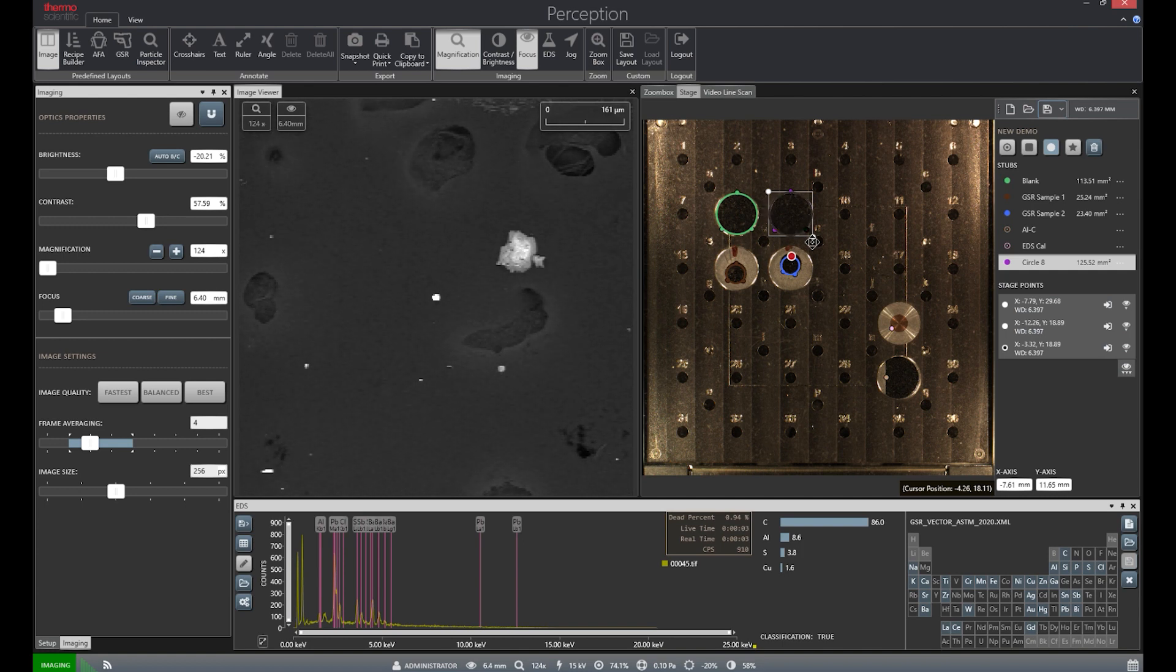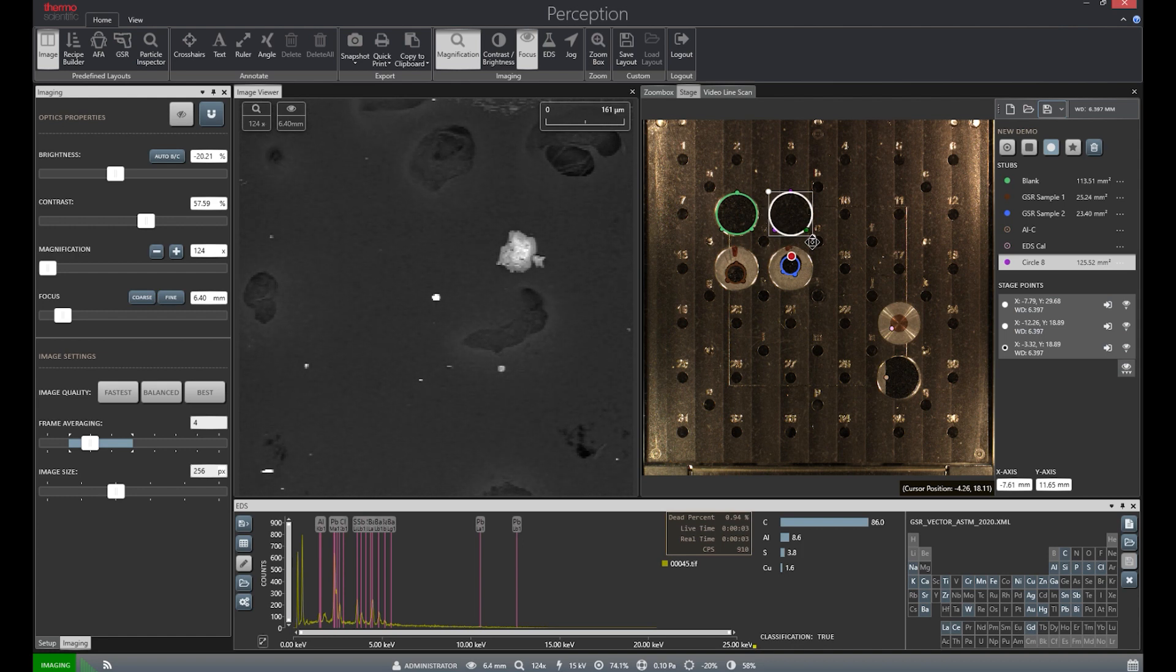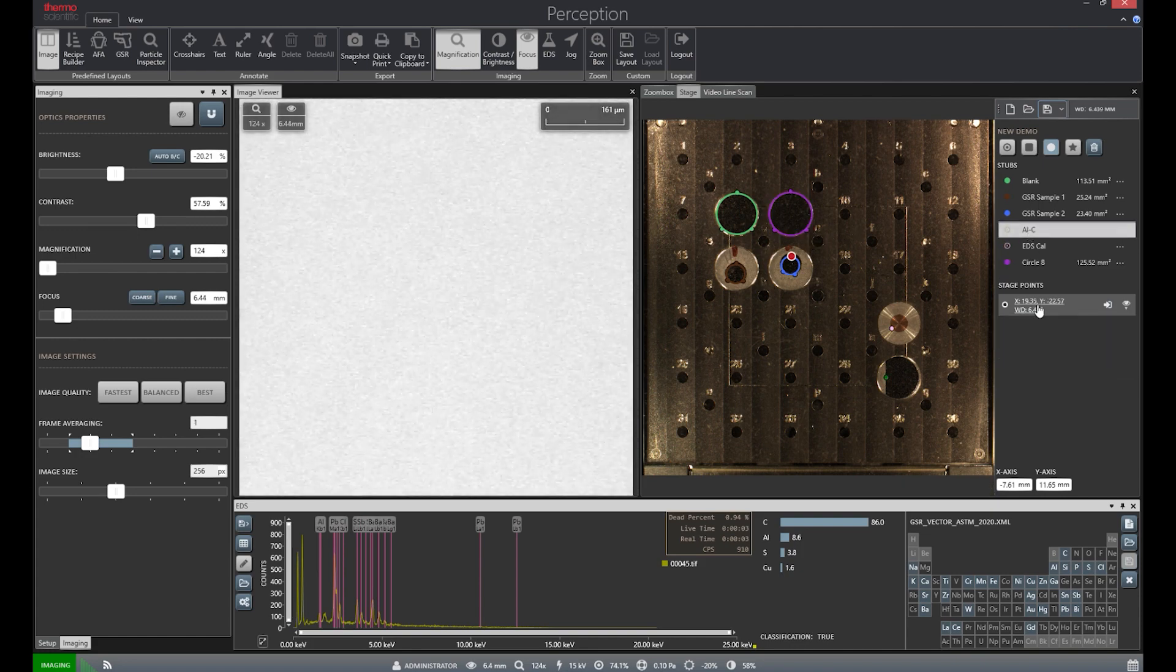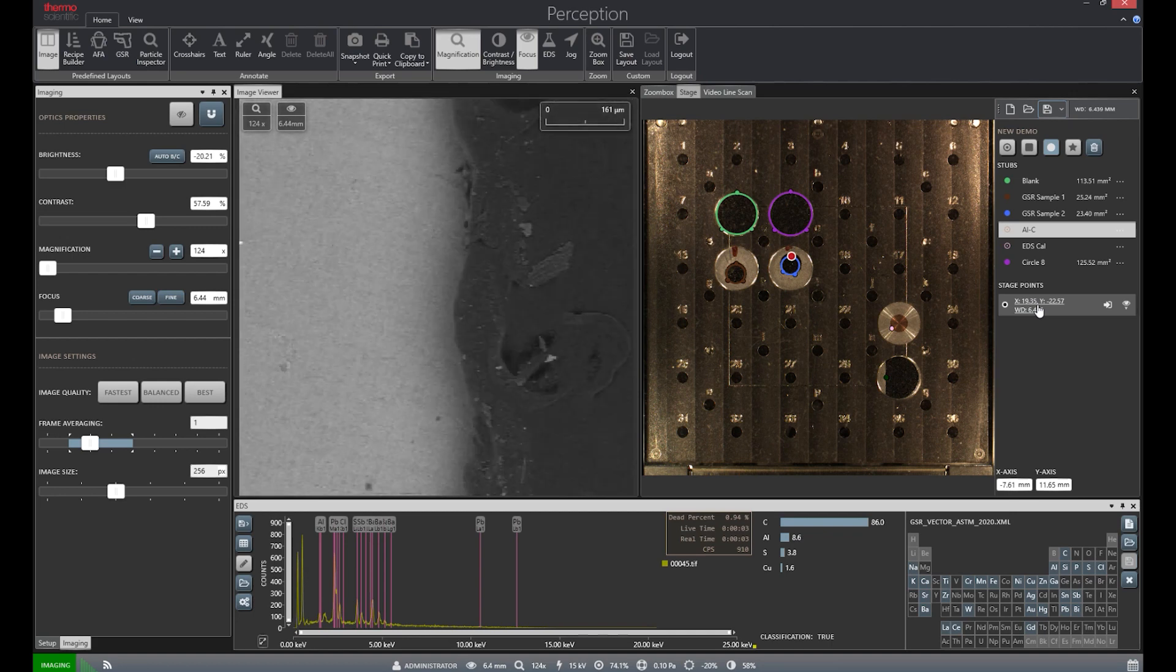Each sample stub will be slightly different though, so areas will have to be adjusted for each. We will also be including a stage point for our auto video sample, which will assist us in adjusting contrast and brightness throughout the run.